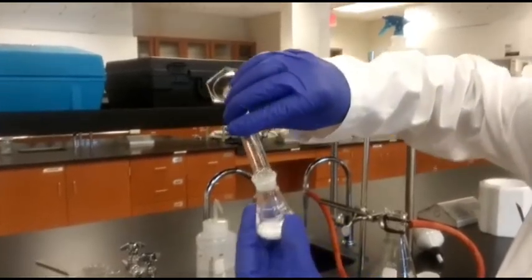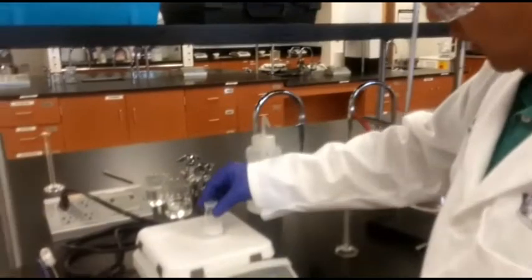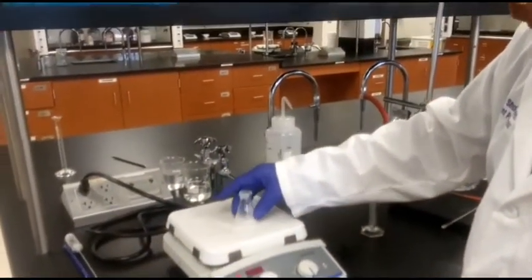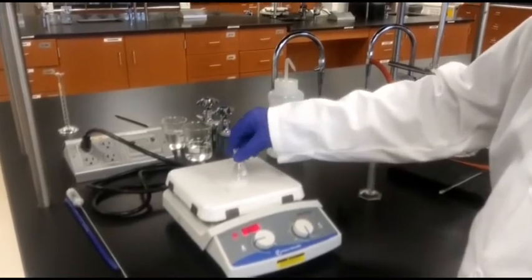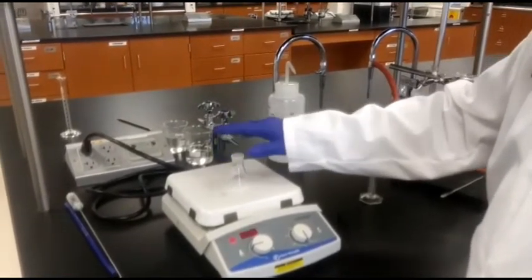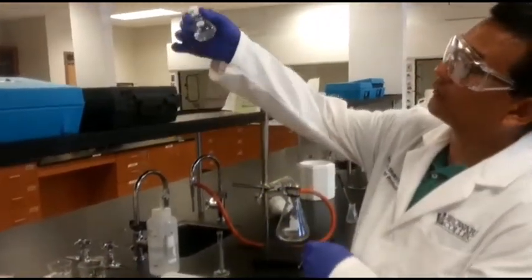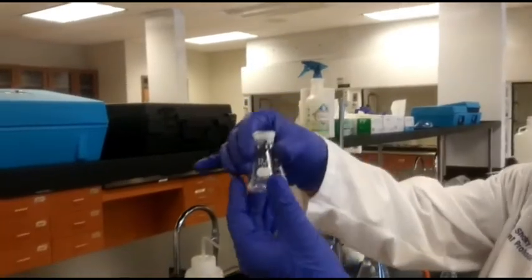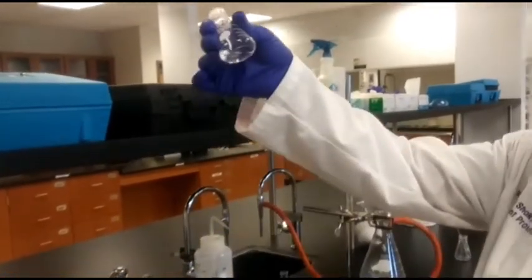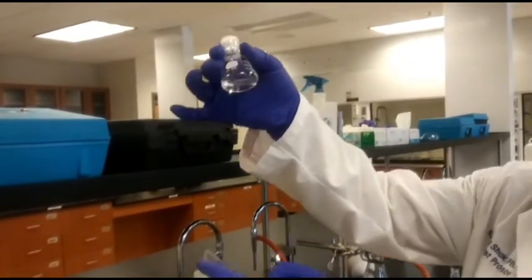to dissolve this. Now since it is not dissolved, I can make it somewhat warm here on the hot plate, just by heating it to some extent. So in hot ethanol it should dissolve. The aspirin is completely dissolved and is a very clear solution in even 1.5 milliliter of ethanol. So we don't need to do any filtration in this one because there is no solid particle anyway.